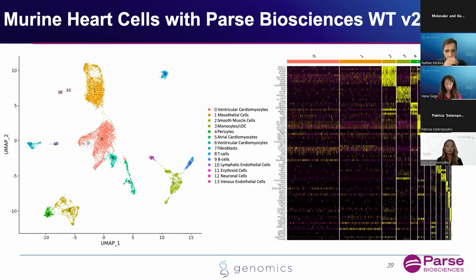And what we saw was great data in terms of cardiomyocytes. Again, we were able to isolate a bunch of them, which we weren't able to do in microfluidic platforms. And again, a variety of different cell types, whether it be monocytes, cardiomyocytes, immune cells.